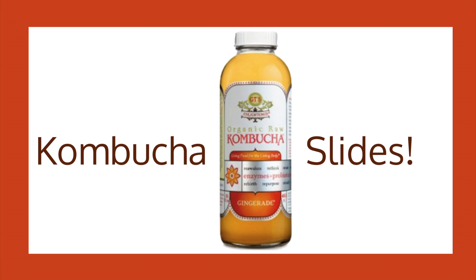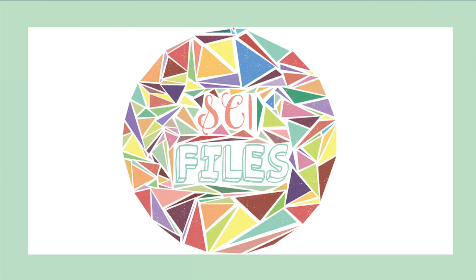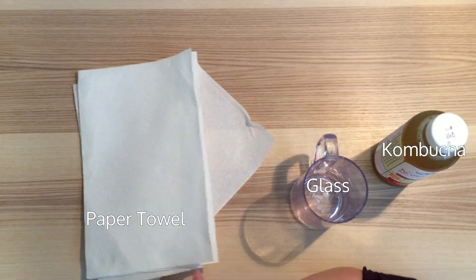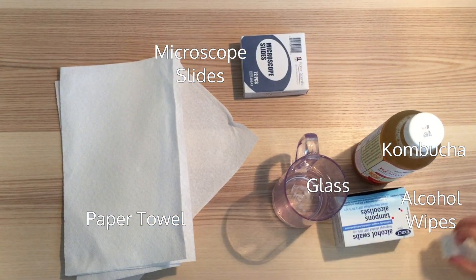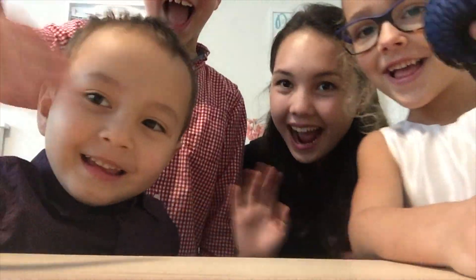Kombucha Microscope Slides. You will need the following: Kombucha, a glass, a paper towel, microscope slides, alcohol wipes, coverslips, and pipettes. Let's get started!